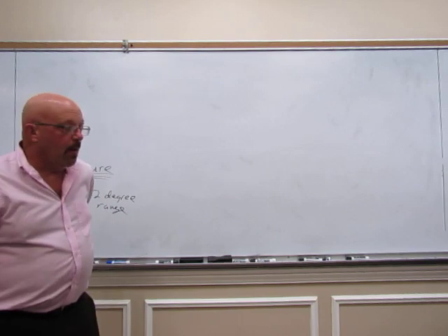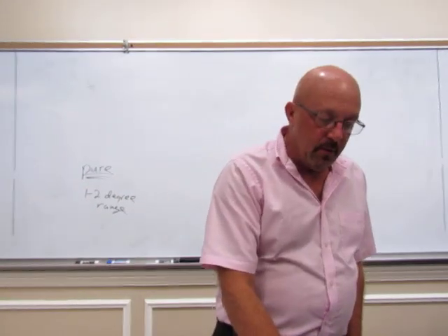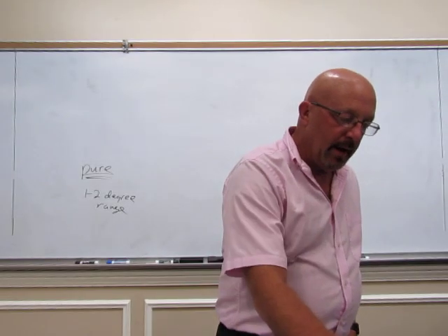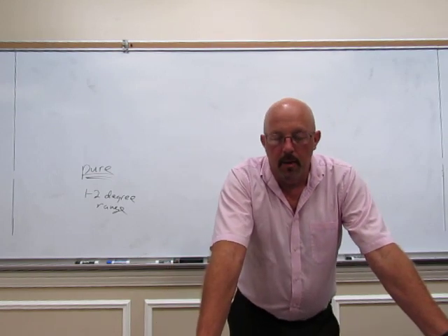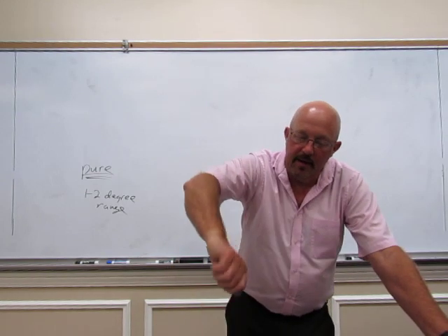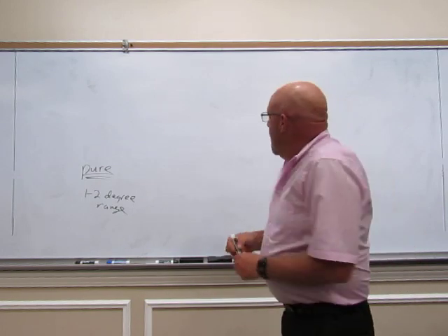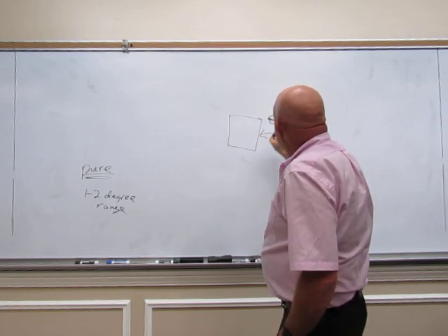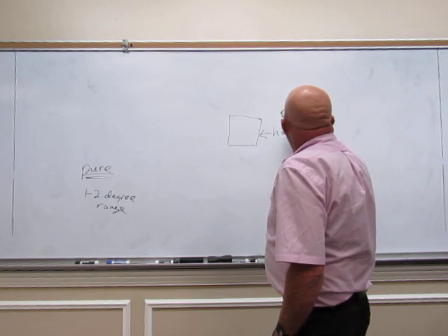Now with your melting point apparatus, we want to heat those slowly. We don't want to heat them too fast. If you take and crank it up on high, what happens is, inside there's, I can't draw very straight here, there is a heating block.